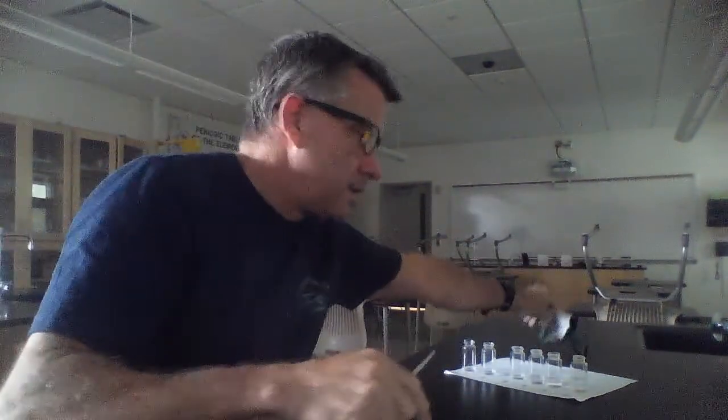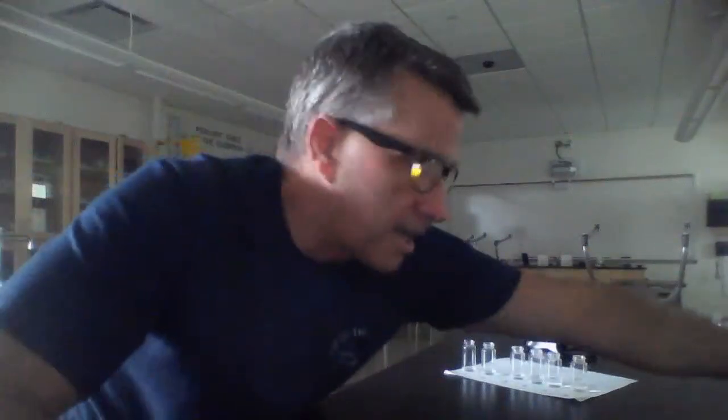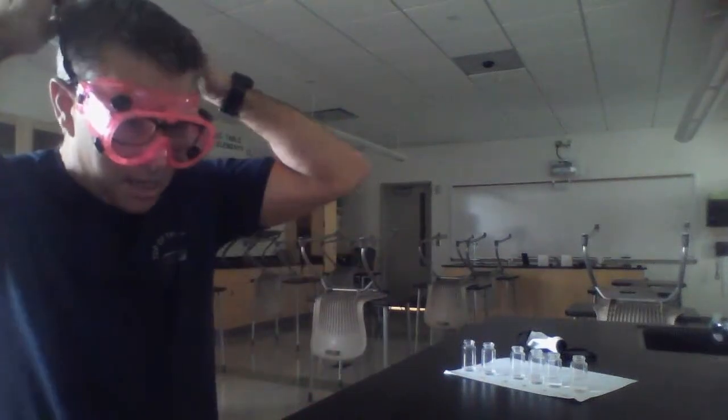For our next step, we're going to light them on fire. Okay, let's take our control samples. Mrs. Wagner's gone, so I don't need this. Nobody's in the lab but me. And let's safely ignite each sample. Why don't we start with our controls, the known samples. So let me get my goggles on. Why don't we do 5 drops of each?